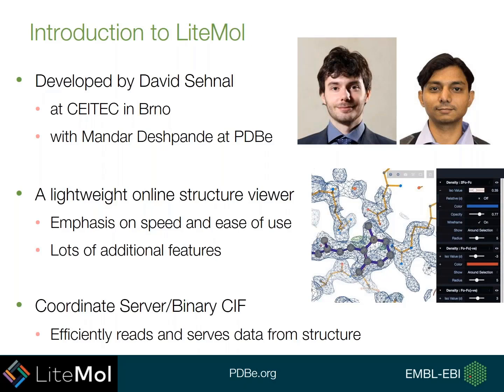Something else that David has worked on is the coordinate server. This is an added extra onto LiteMol, and it is improving the speed even further by only serving you data that you need and speeding things up even further.